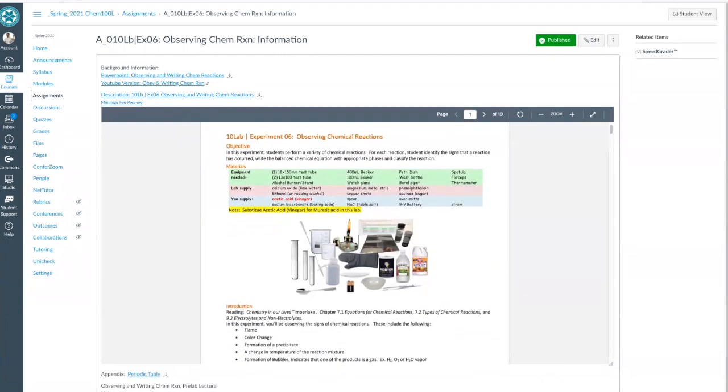Notice that I tell you what material you should have in your lab kit, what chemicals Miramar College should supply, but I noticed that ethanol might not be there. And what you guys need to supply, something like baking soda, and vinegar is something that you would use.